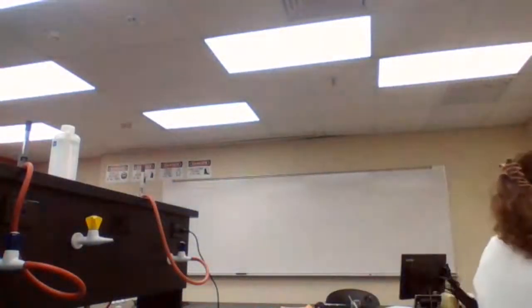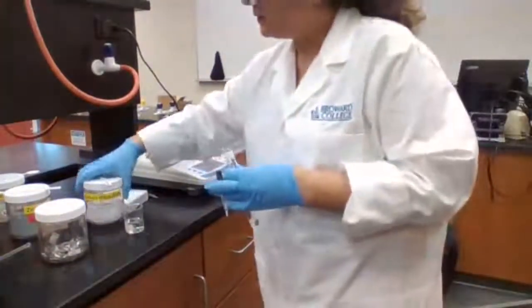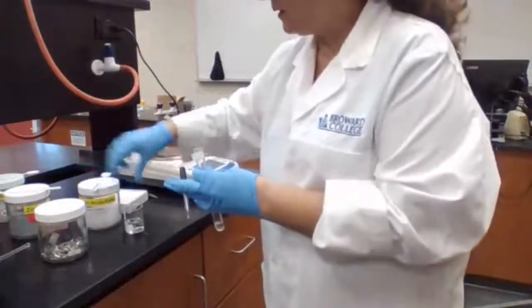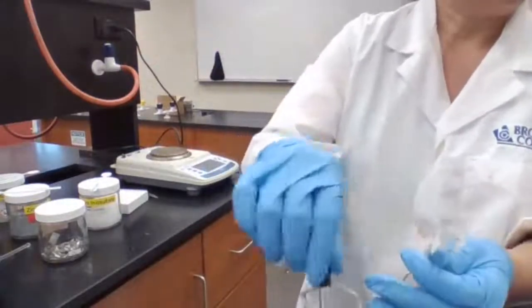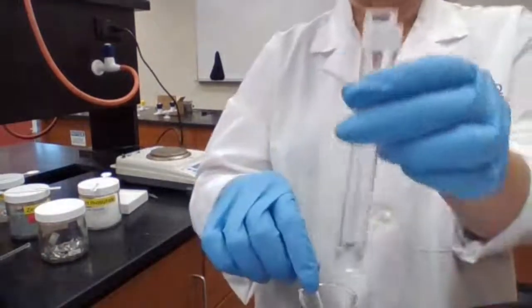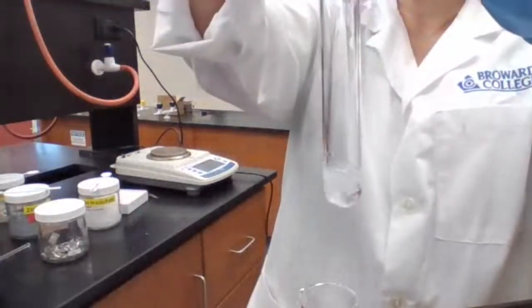Then I have the sodium thiosulfate here. It's 3 crystals of sodium thiosulfate dissolved in deionized water. And I'm going to add a few drops, just a few drops, and let you watch and see what happens, because you need to record your observation. I'm going to add a few drops.